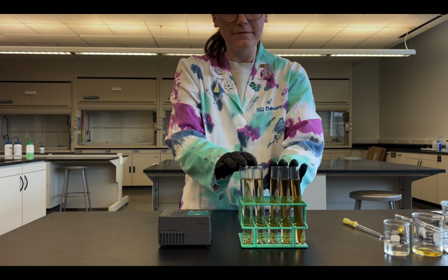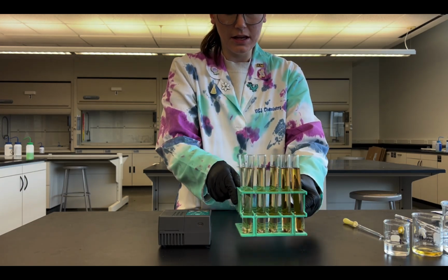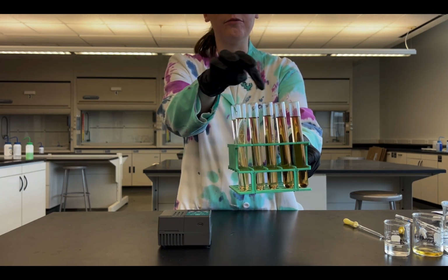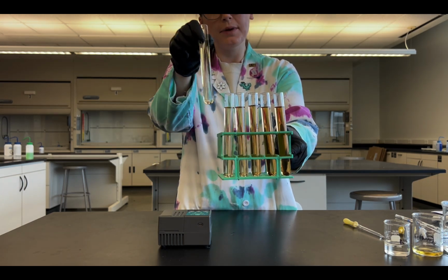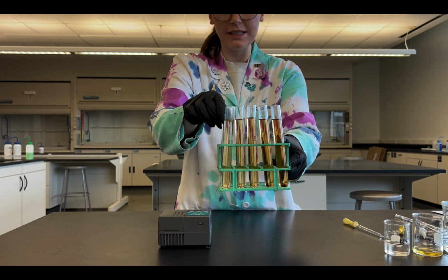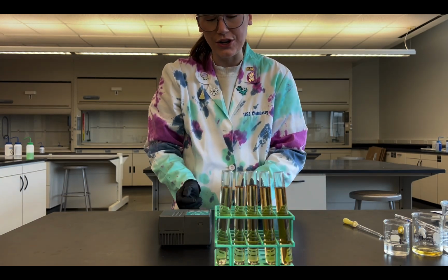So here are my 5 solutions plus my blank. Might be a little hard to see in the camera, but they are getting darker and darker in terms of how much more red they are compared to the blank. Maybe that comparison is easier to see. But as you saw when I was creating it, they also got darker and darker.